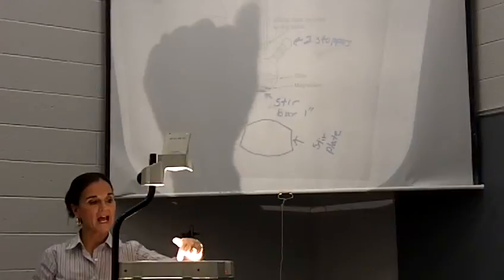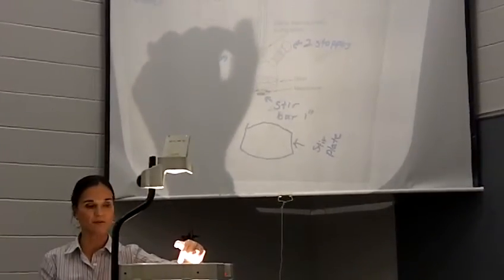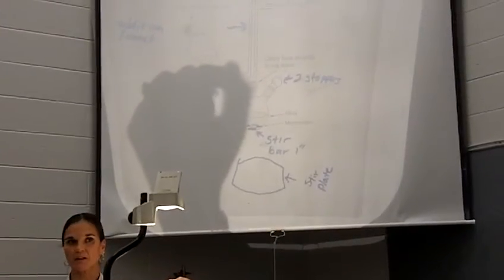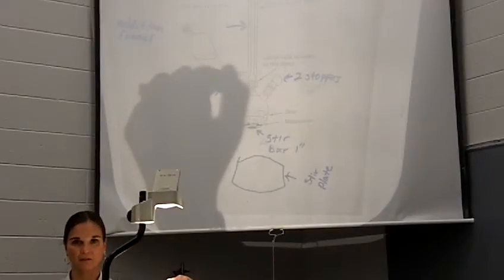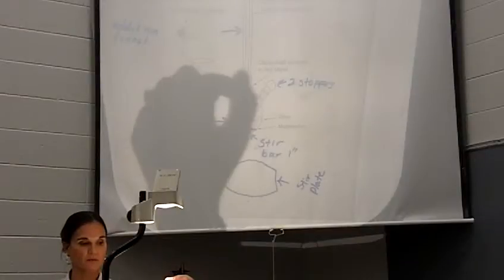Then you're going to have your separatory funnel on here. Remember, when we go to put things in the oven, no Teflon pieces from the separatory funnel in the oven. Okay, the stopcock will melt in the oven. All right. Stir bar's okay. No Teflon pieces from the separatory funnel.